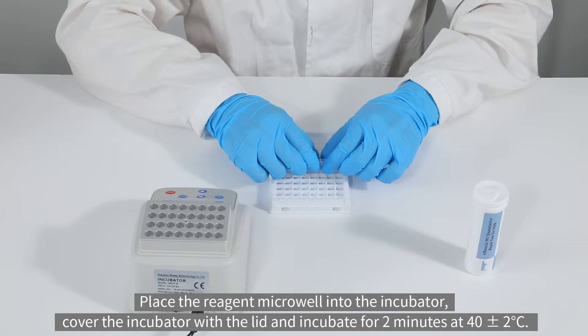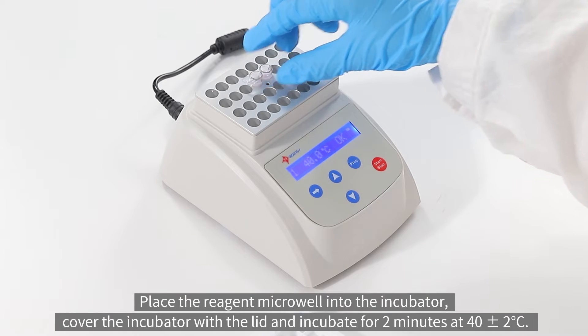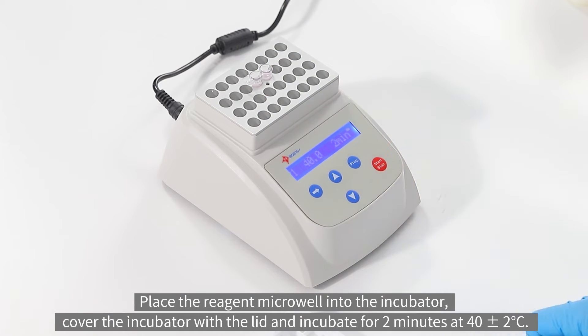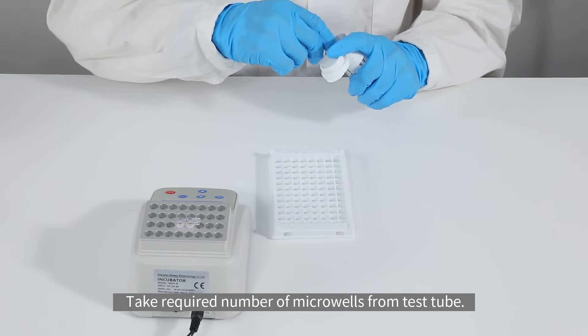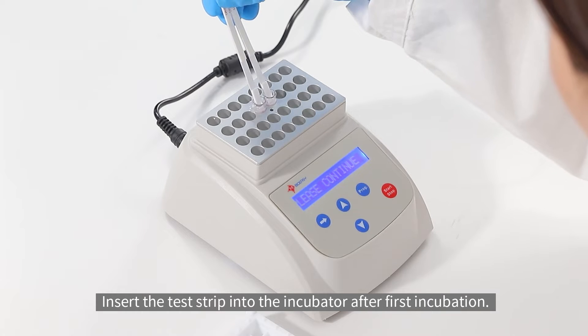Place the reagent micro well into the incubator, cover the incubator with the lid, and incubate for two minutes at 40 plus or minus two degrees Celsius. Take the required number of micro wells from the test tube and insert the test strip into the incubator after the first incubation.